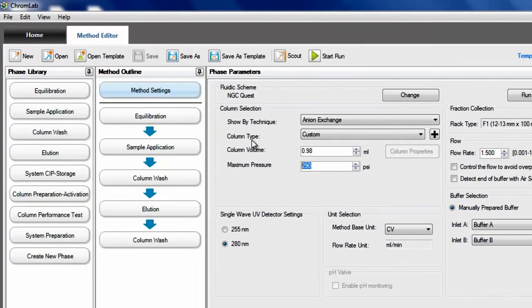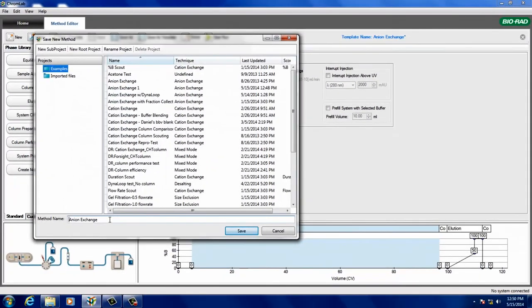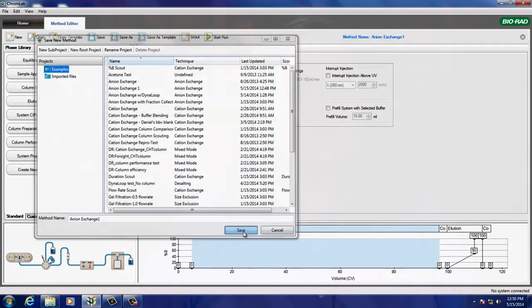The back pressure limit must be set to 1,000 PSI when using the Dyna Loop with the NGC system. Now highlight the sample application phase, change the inject sample from loop/static loop to Dyna Loop, and then change the injection volume to the desired volume you just loaded into the Dyna Loop. Now name and save your method and you're ready to go!